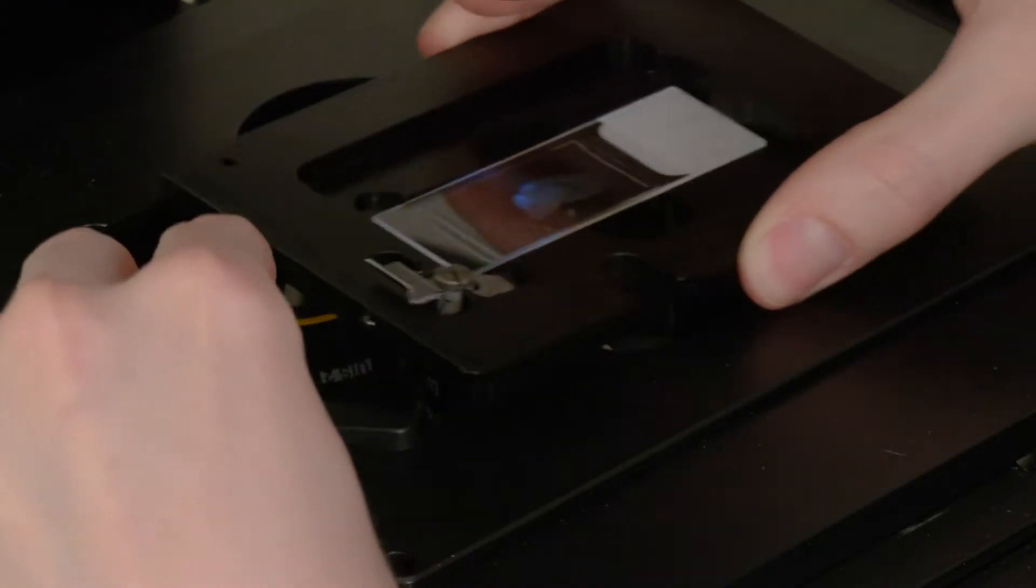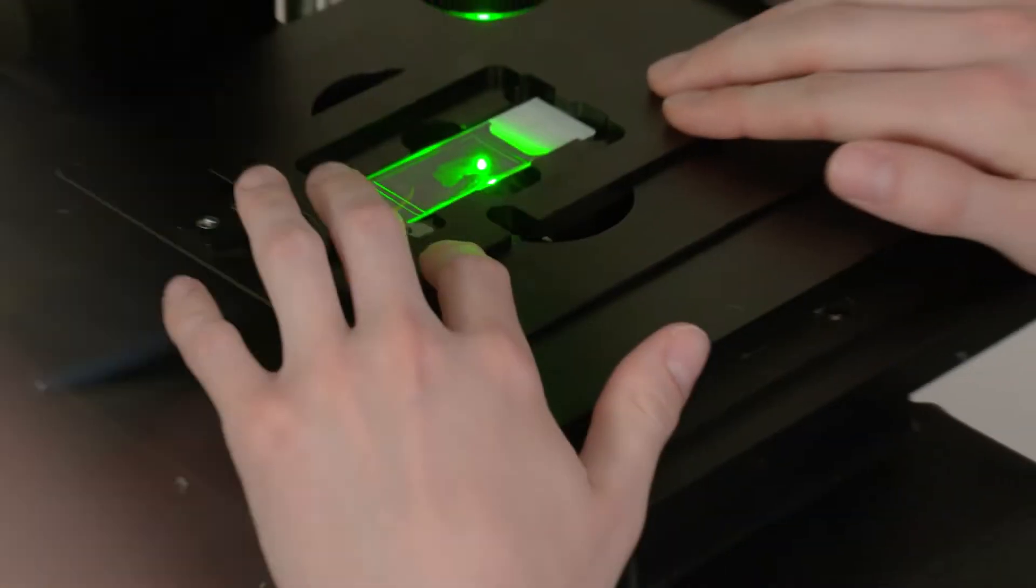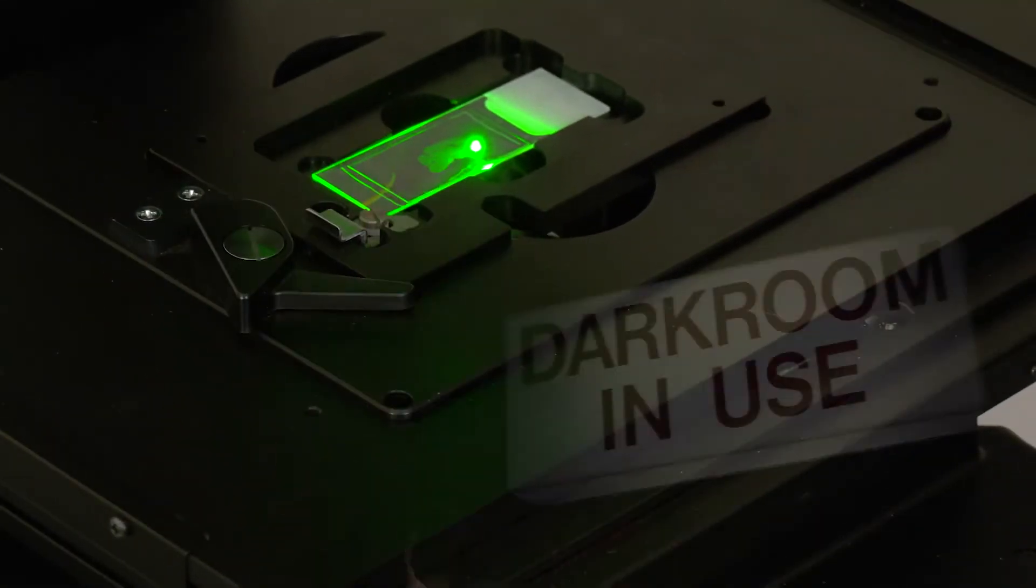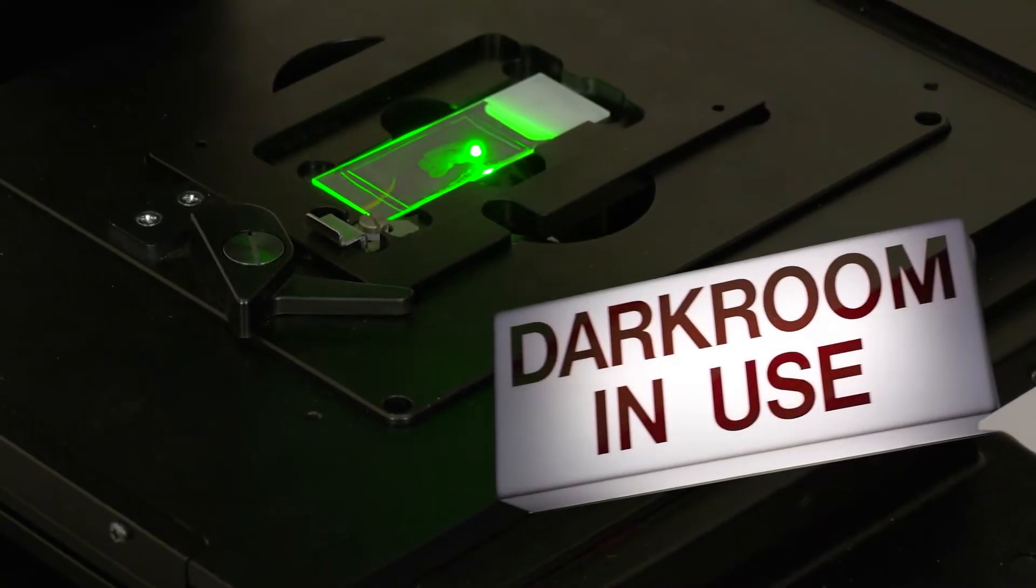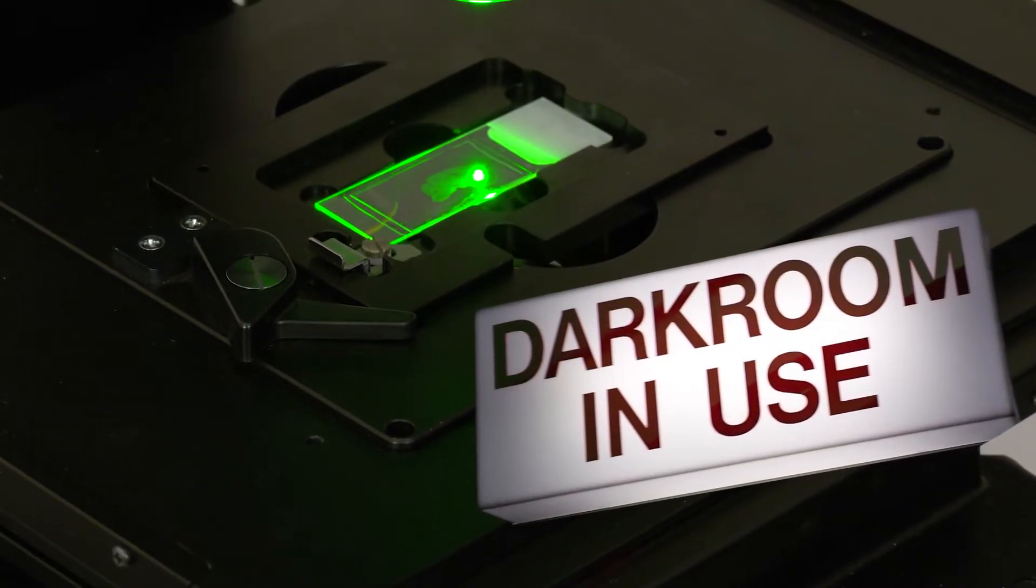If you want to capture fluorescence data, conventional microscopes require a dedicated darkroom, limiting their accessibility during wet lab experiments.